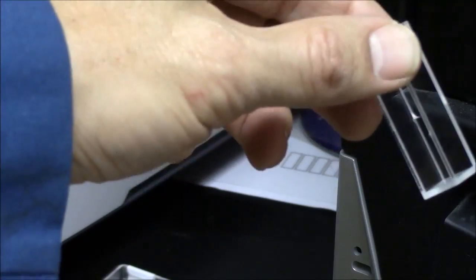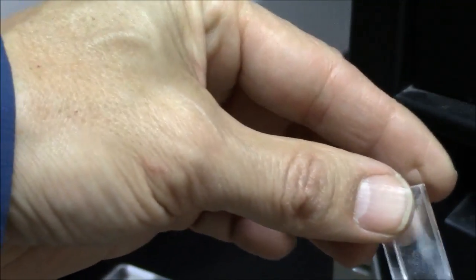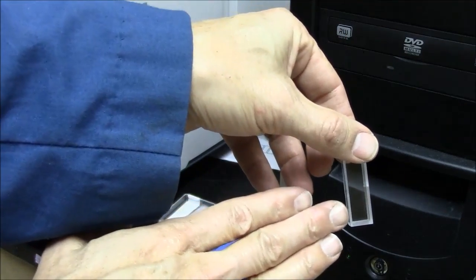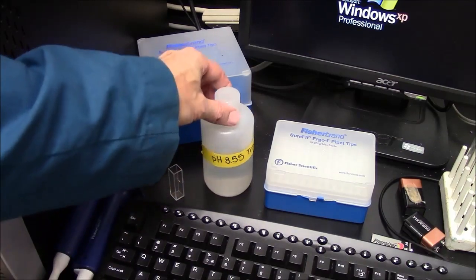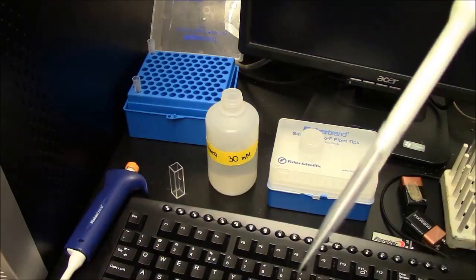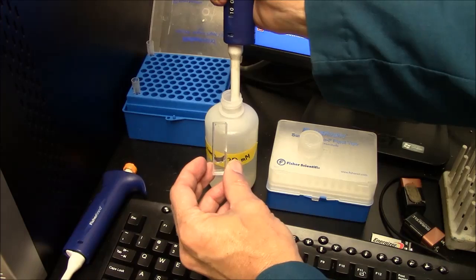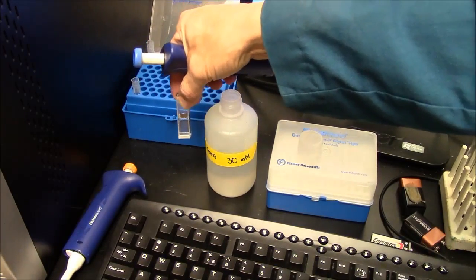The fluorometer uses cuvettes, similar in concept to those used in a UV spectrophotometer, but all 4 sides are clear in a fluorescence cuvette. Light comes in from the side, and you measure the light output from the front face. Light in, light out. For fluorescein, the fluorescence is dependent upon pH, and we want a pH at least 7 or above, so I'm going to use this tris buffer here, which is pH 8.5. Minimum volume recommended is a milliliter. I'm actually going to use 2 milliliters. So you can see that fills the cuvette about half full.